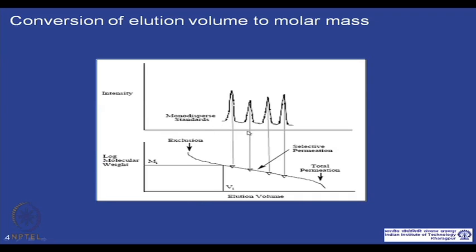So, from this calibration curve, we can easily convert this elution volume to log molecular weight data. This is the way calibration is done for a GPC.